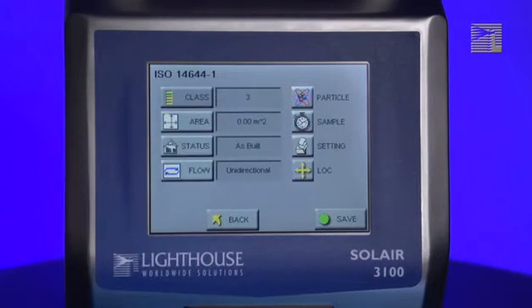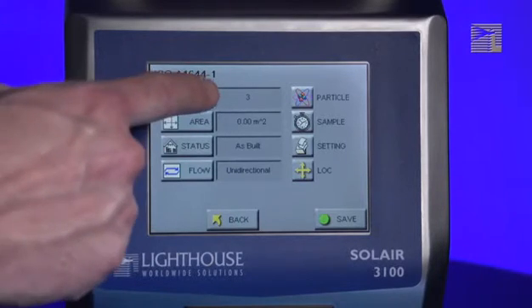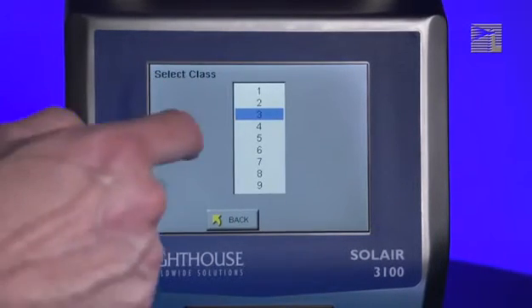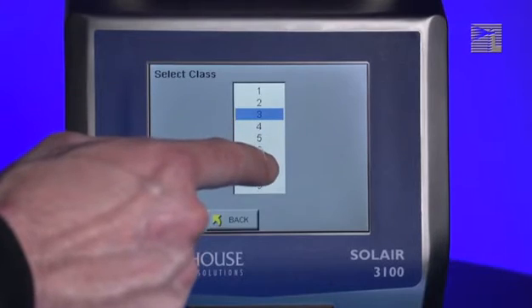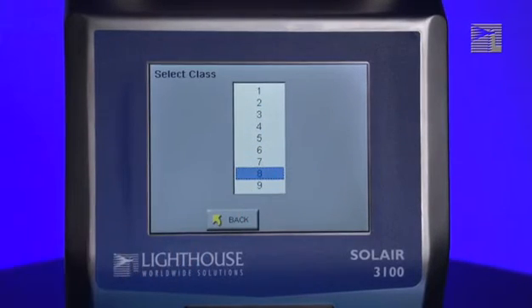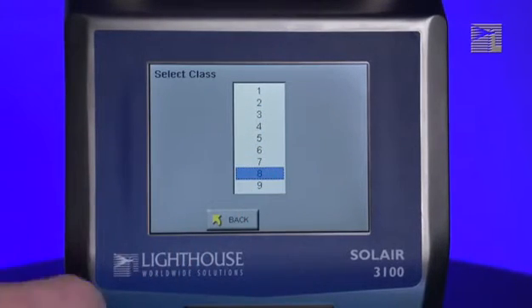For the ISO 14644-1 report, press the Class button to select the ISO class cleanroom of the room you want to run the report on. Then press the Back button.